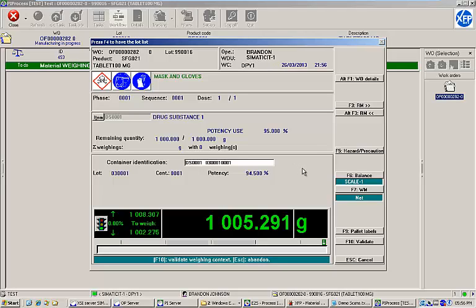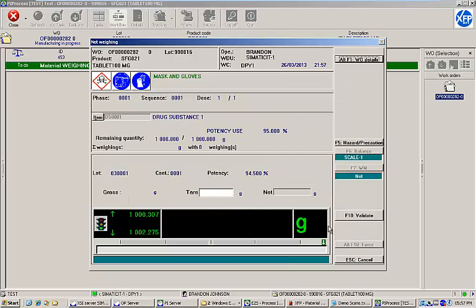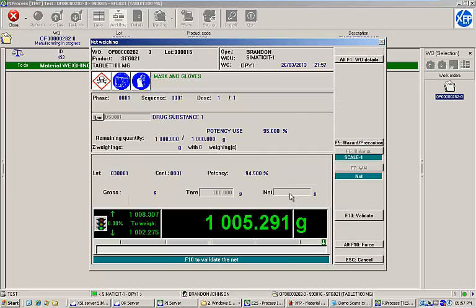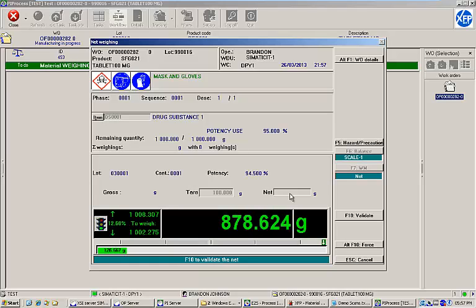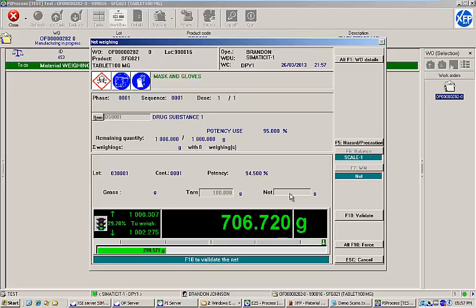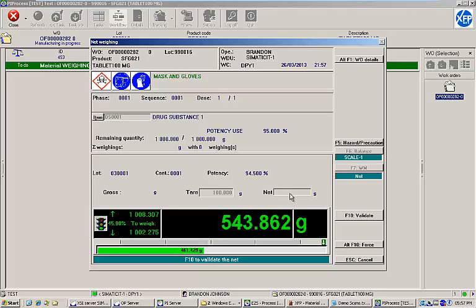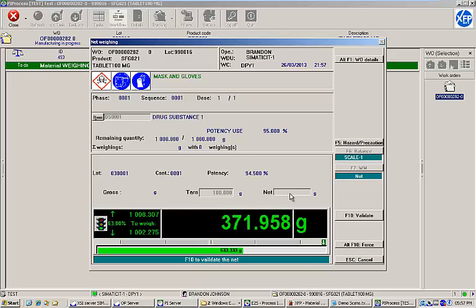Next, I'll begin to weigh my material. XFP's weighing module fully integrates with scales connected via serial or USB ports. This scale interface allows the MES to display the quantity remaining to weigh and ensure that operators weigh the correct amount.